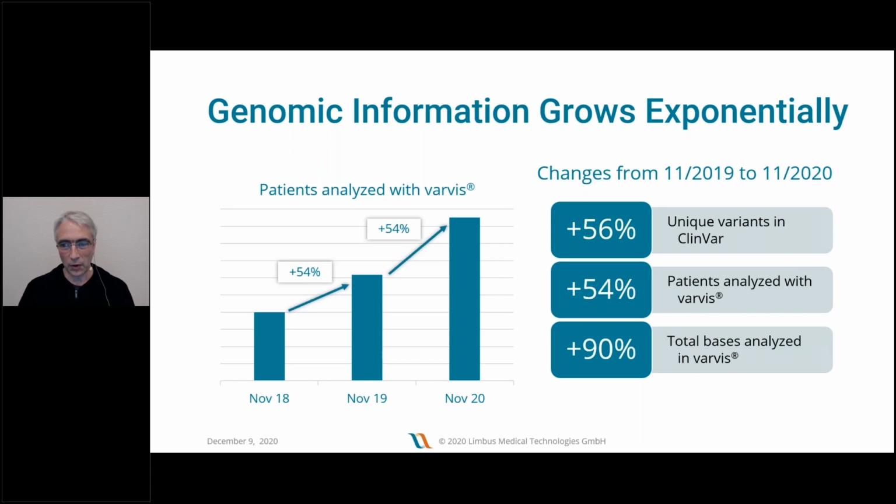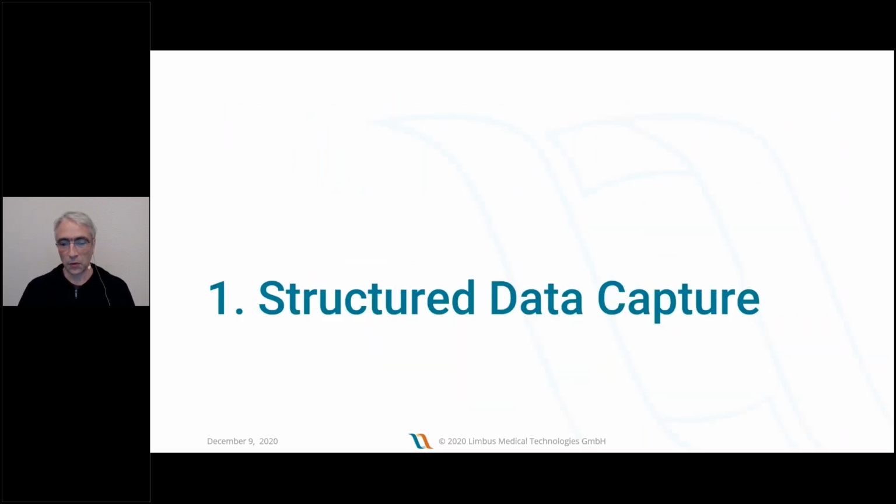So if you think of these challenges that you're facing in the laboratory, I would like to explain 3 important principles that you should apply in your workflow and your diagnostic processes that will help you to tackle this flood of data. The first principle is capture the data in a structured way.